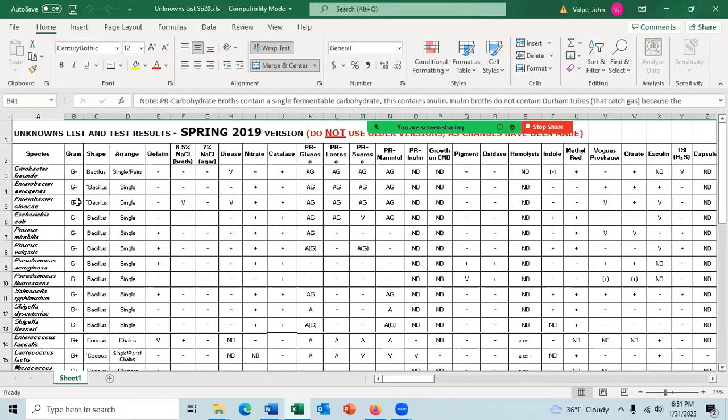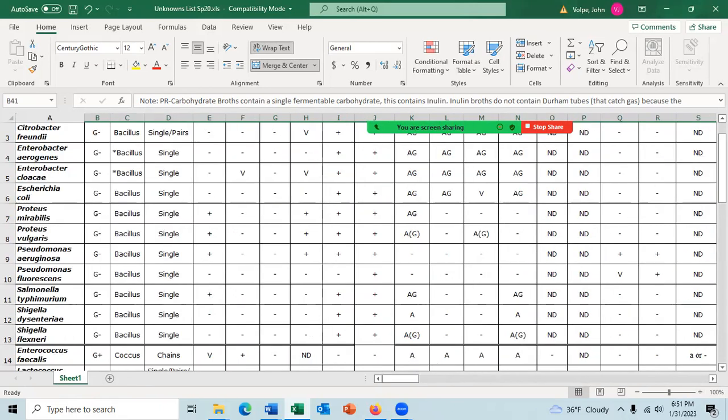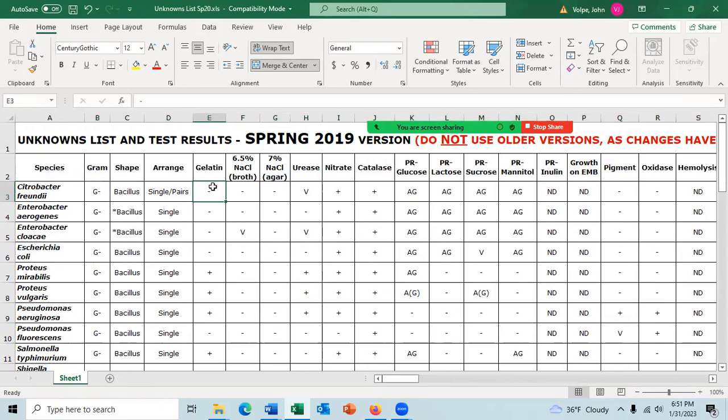So for the gram test, these are gram negative. For the gelatin, let me blow this up. Gelatin hydrolysis. These species are negative. These species are positive. That's negative, that's positive, etc. Any questions?